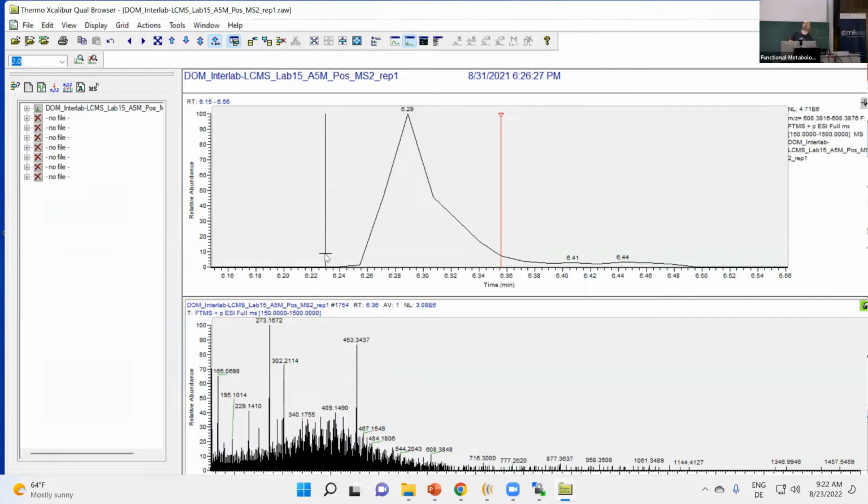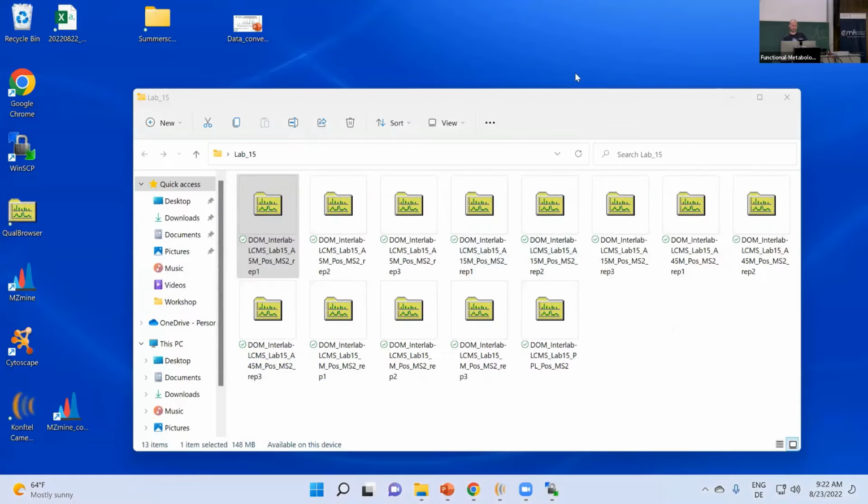I don't know if Robin and Stefan can comment, but if we would have doubled the data points, it might be better, or I don't know, even tripled, and that would be much better. But yeah, I think from a first sanity check it looks fine. Obviously, I hope that they also looked at the QCs before they uploaded the data and deemed it to be of high quality. They did not have this in the folder, so I could not check the QCs now. If this were my own data, I would of course check that as well.